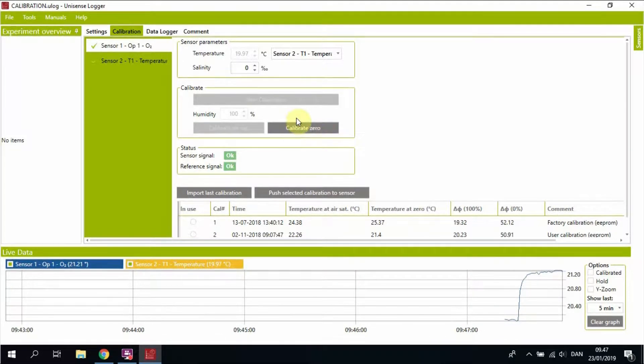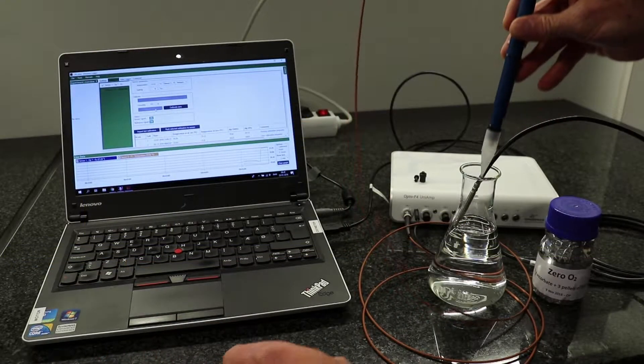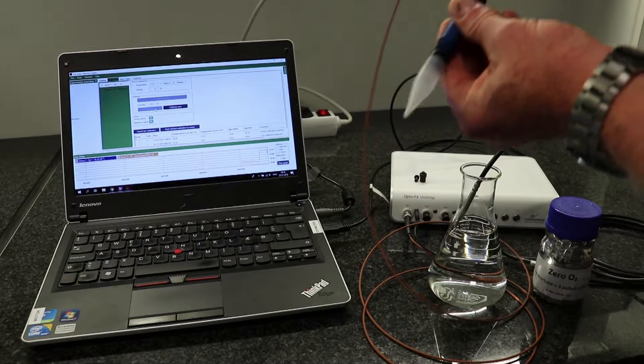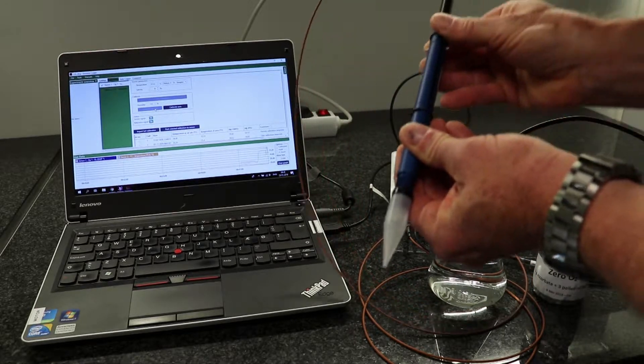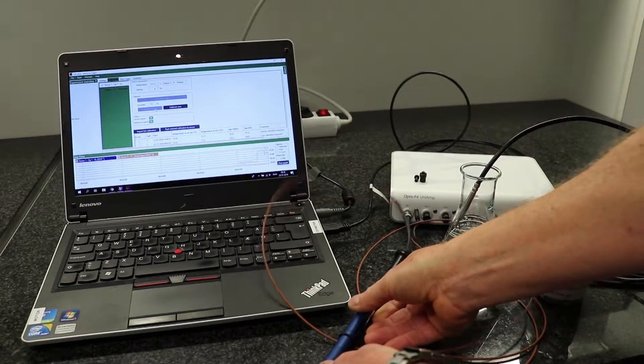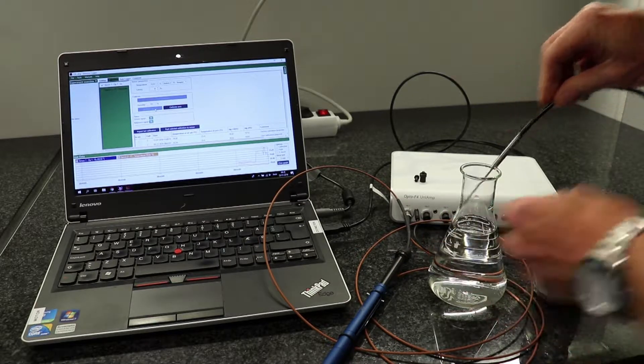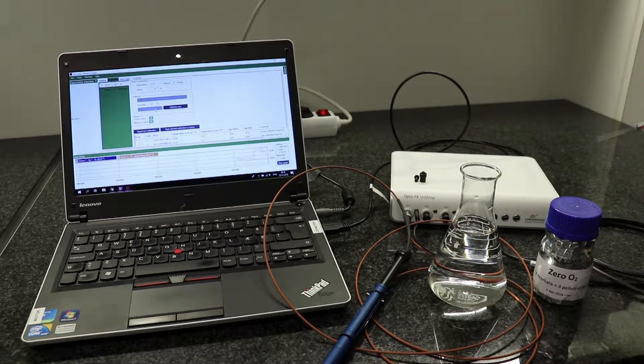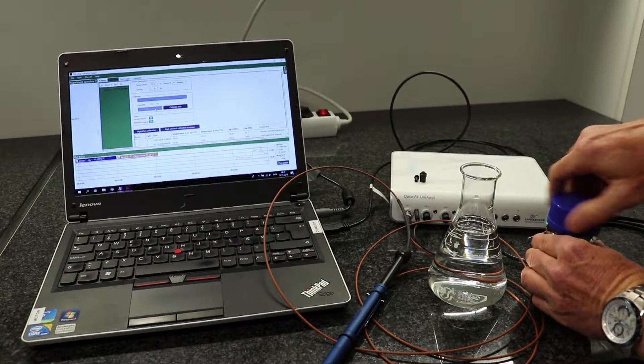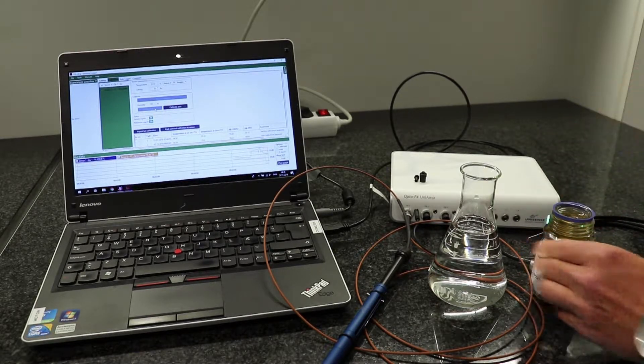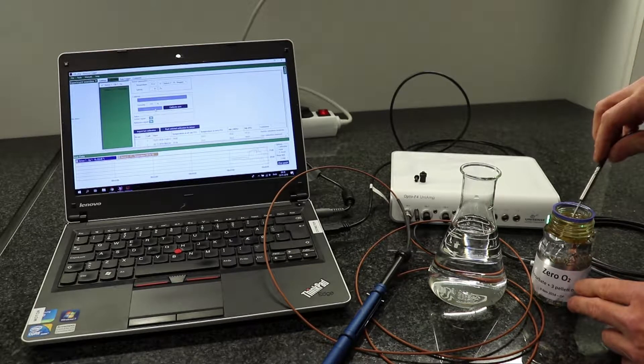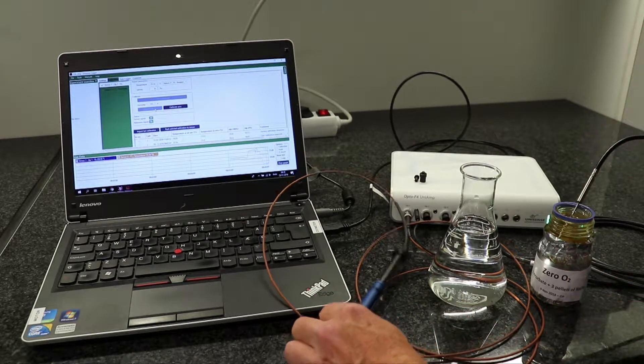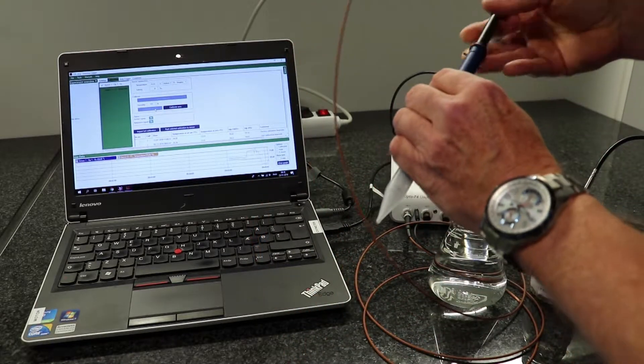Now it is time to do the zero oxygen calibration. Wipe off the temperature sensor to avoid bringing oxygen rich water into the zero solution. Position the temperature sensor in the zero solution.